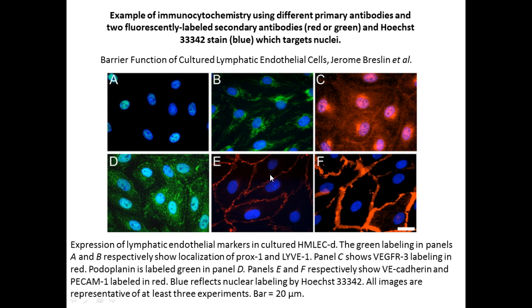But again, just to show you, right, that even by this different coloring, and just like how we talked about with the fluorescence with the different sperm, right? How they made one green and one red, right? And here they're using antibodies to be able to tag, right? That's the difference here, is that these fluorescent dyes are stuck to the antibodies. So then the antibodies are sticking to the cells, and we can actually see where they're sticking microscopically.